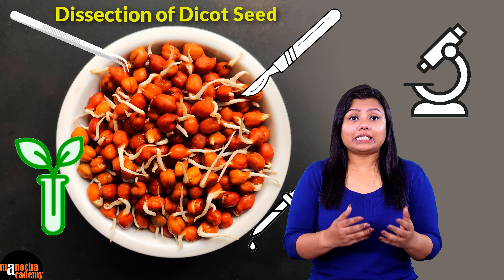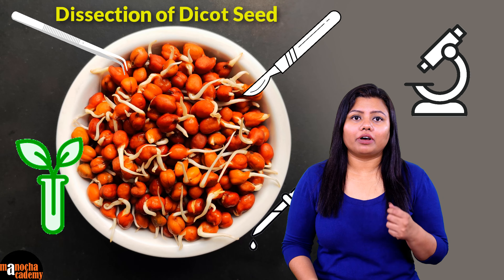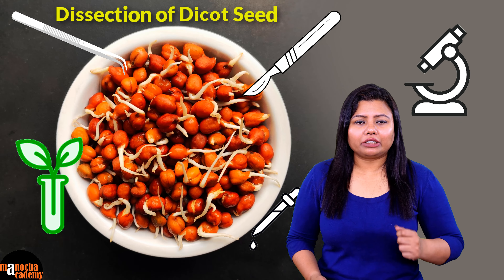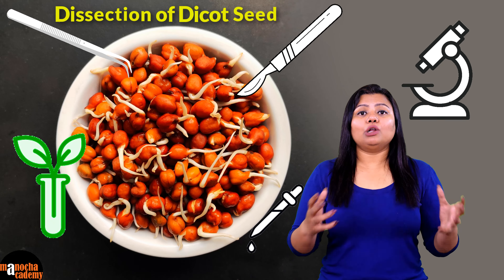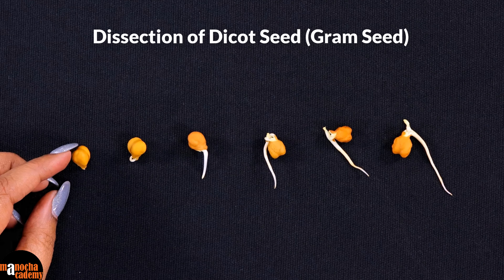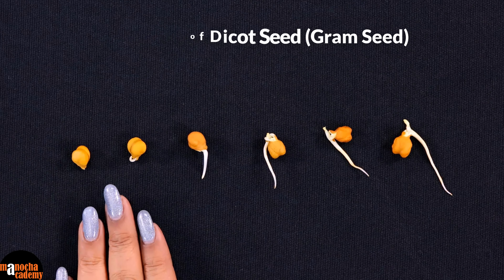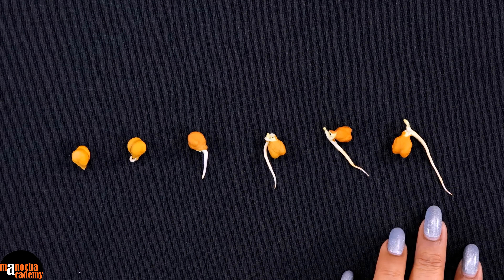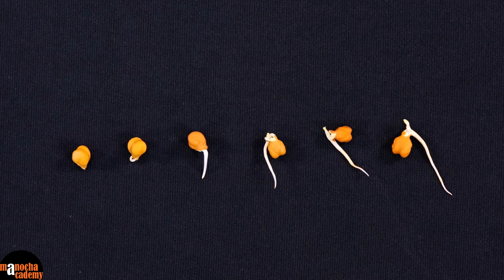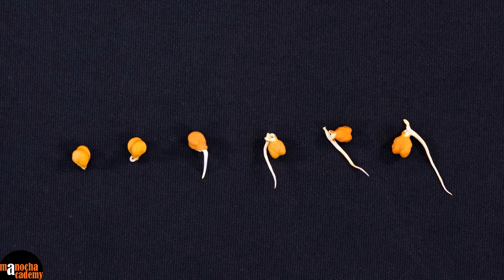Let us go through a dissection of a sprouted gram seed and look at its different parts to study them. I have taken a gram seed as you can see here. I am showing the different steps of growth of the radicle and the plumule, that is the embryo.